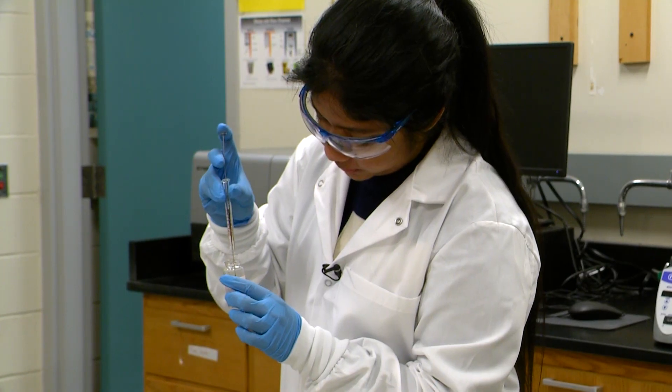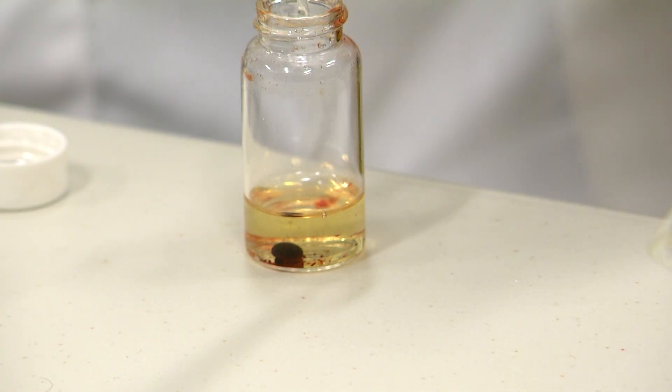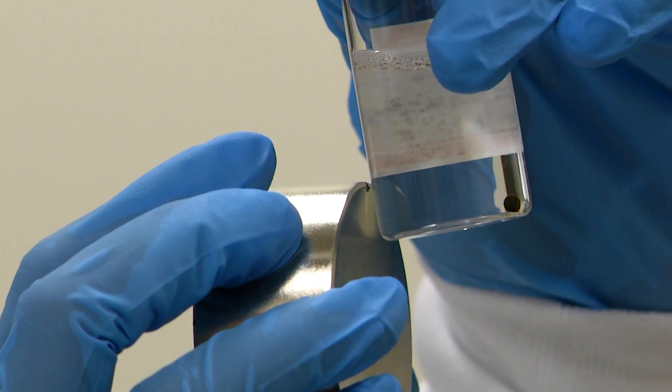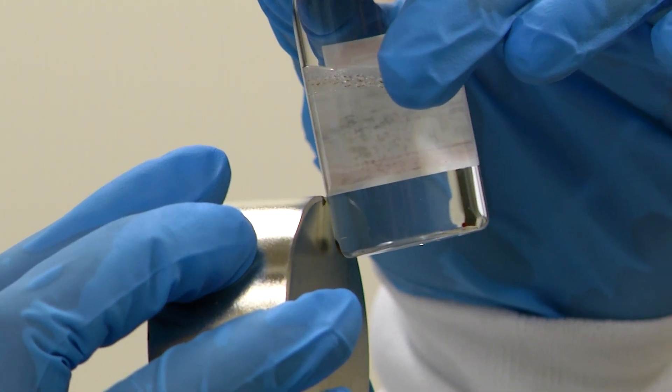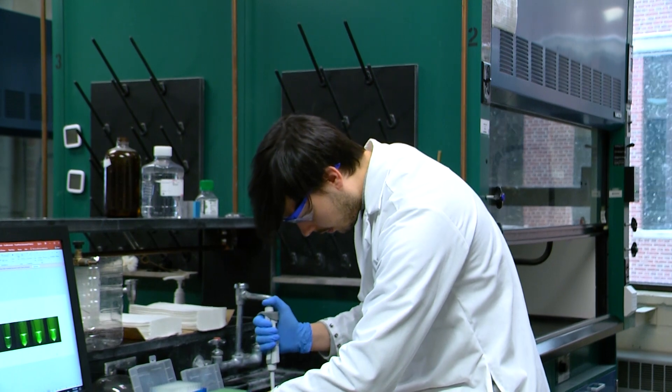We have developed these magnetic ionic liquid materials that can capture bacterial cells or DNA from a sample. As you can see, it gets attracted to the magnet. We then can take this magnetic ionic liquid, elute the cells, and do analysis.